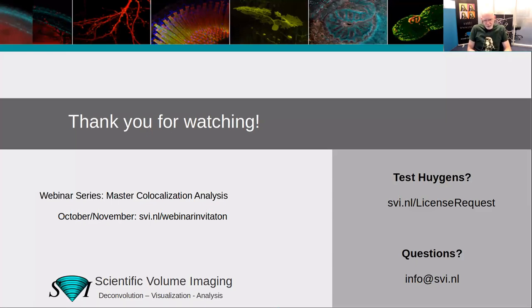There is a question about the pyramid file format. The file does not open in Fiji, but there are existing open source viewers for HDF5, so you can look into the file structure. This format is at this moment not supported by Bio-Formats. What is supported is ICS2, but that does not have the pyramid file structure yet, unfortunately. We keep on developing, of course, but at this moment you can probably not open the Huygens pyramid file structure in Fiji.